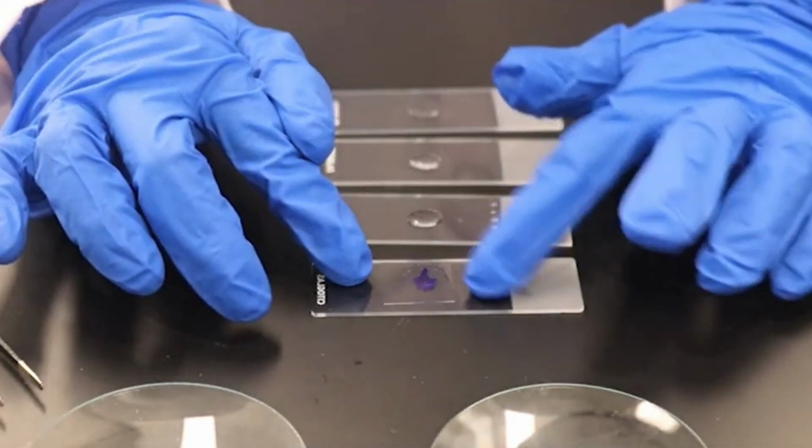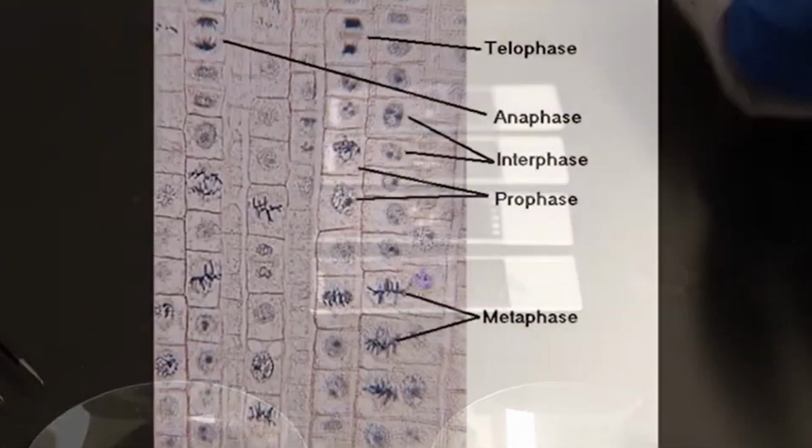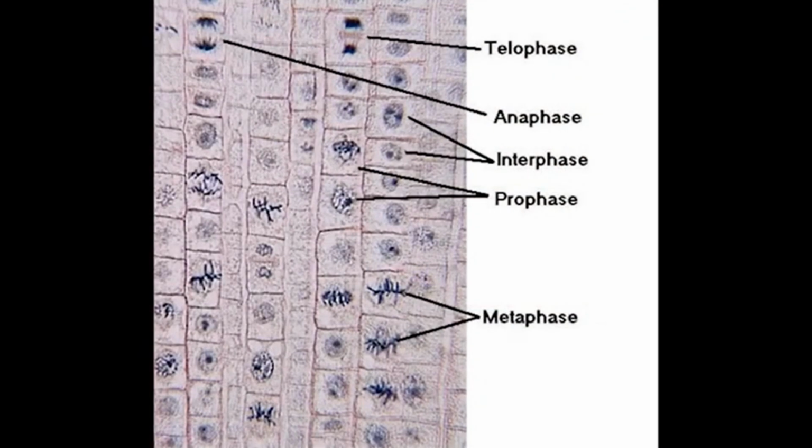Now, by placing the prepared slide containing the squashed garlic root tissue onto this microscope stage, we are free to observe based on our preliminaries of mitosis. What may be obtained? Well, chromosomes in various phases of mitosis will become visible under the microscope.